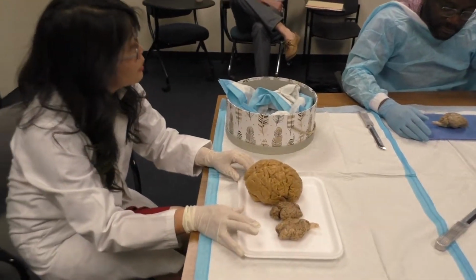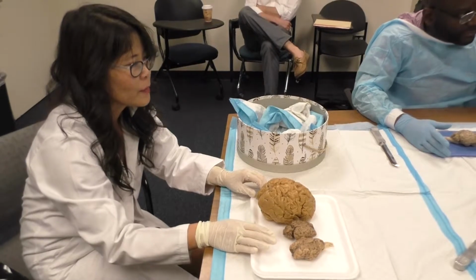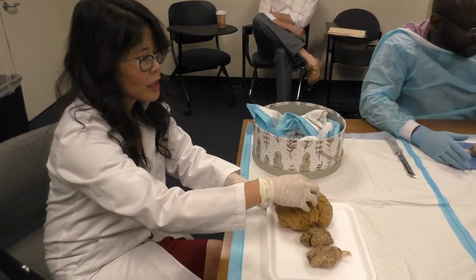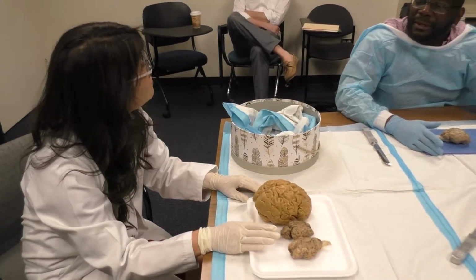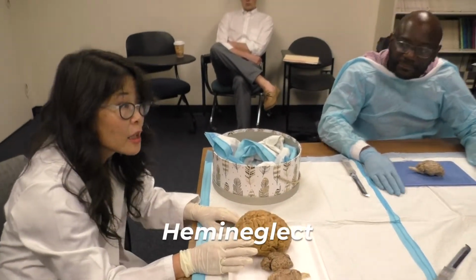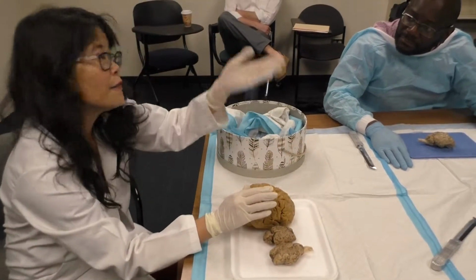It's not just a motor area, but it's really important to help you make cognitive decisions. It's also an area that, the example my undergrad students love, is a lesion in the right parietal lobe. What would that do to you? Oh yeah, is that the hemi-neglect syndrome? Yes, hemi-neglect. So a right parietal lobe lesion is processing information from the left side of your space.